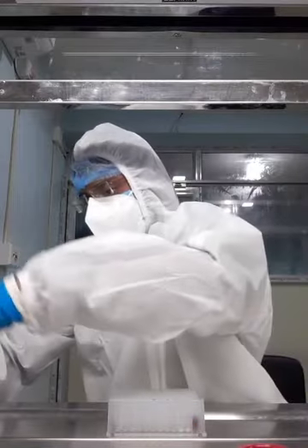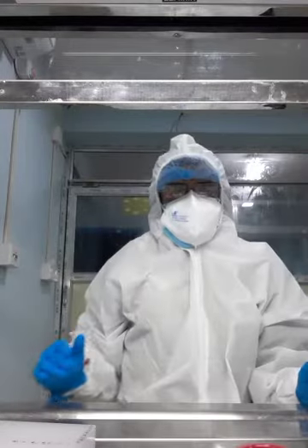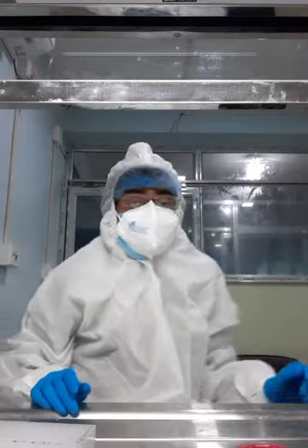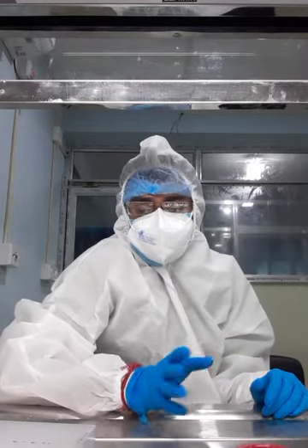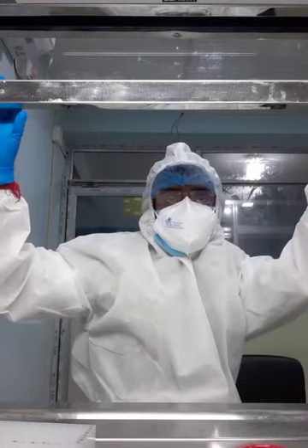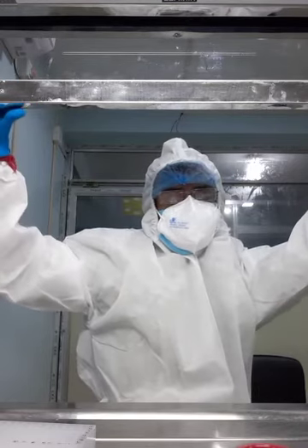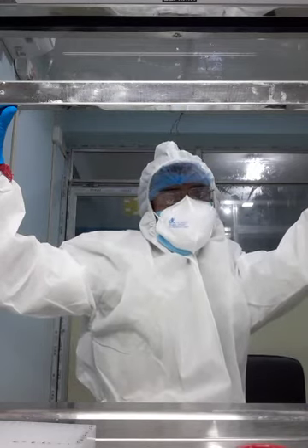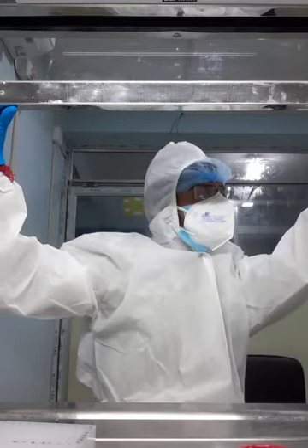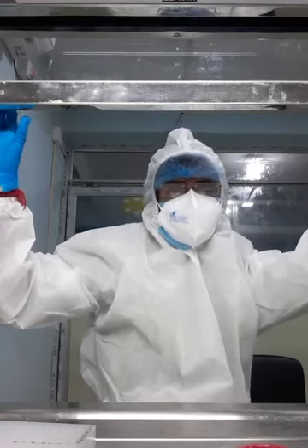You have to keep the deep well plate for 2 to 3 minutes. Then let's start the RNA extraction machine. Until you start the RNA extraction machine, you are not able to proceed. So keep the plate as it is, close the sliding door of the biosafety cabinet. Then you have to go to the machine you have for RNA extraction and switch it on for the process. Stay tuned with us.